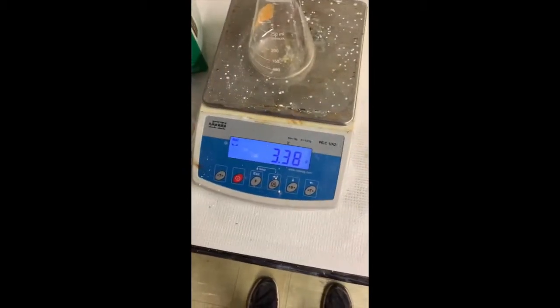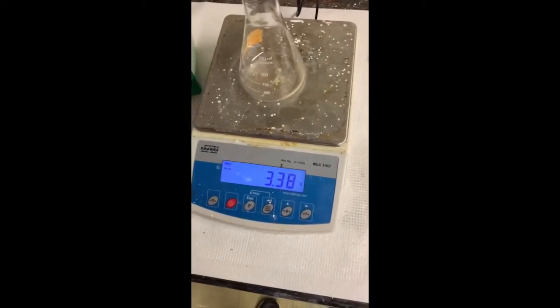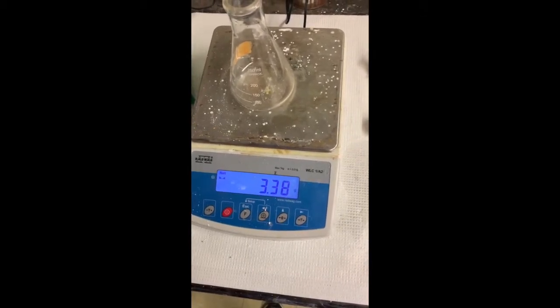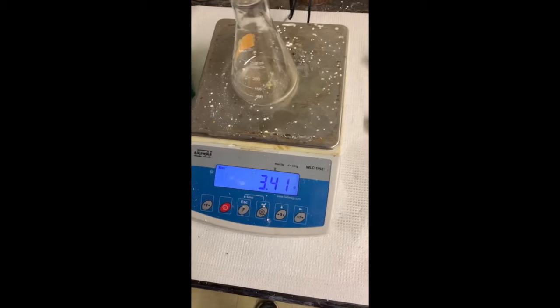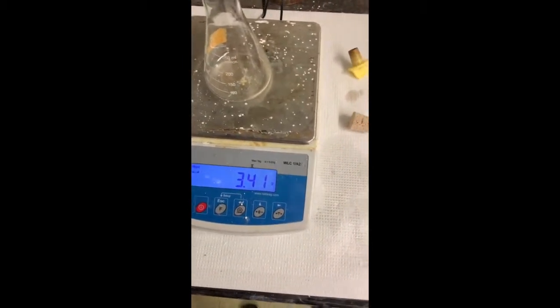A little bit more. All right, one drop should do it. Nice. A little bit over, but hey, it's only about one off. All right.